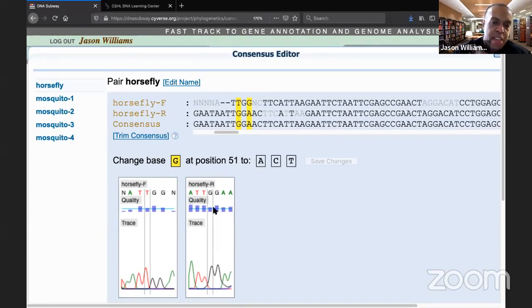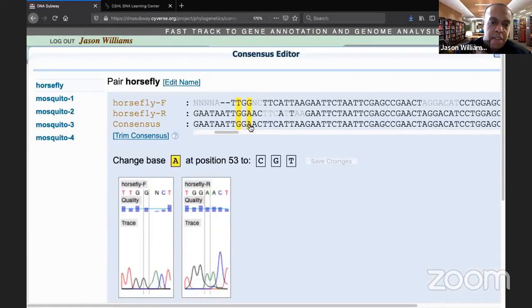And then there's a G at that same position when it's aligned. So the alignment itself may not be perfect, but certainly there's a conflict. You can see there is a little bit of what we call misalignment. Alignment will be more important next week, but we're trying to line up both the sequences so they start and stop at the same place. That's the essence of it.